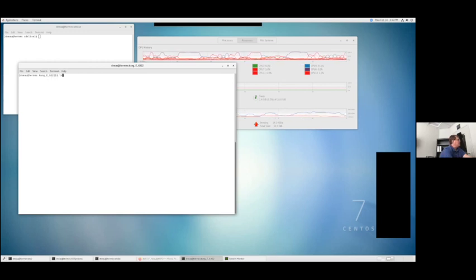And if I do an ls here, it's got two directories, images and process. Now if I switch over to the process directory, it's got another directory called Rapid. And if I go into that, and now go to integrate, it has a directory for every data set that was collected for that data collection trip.